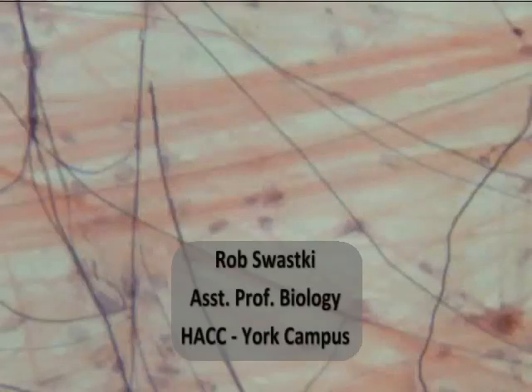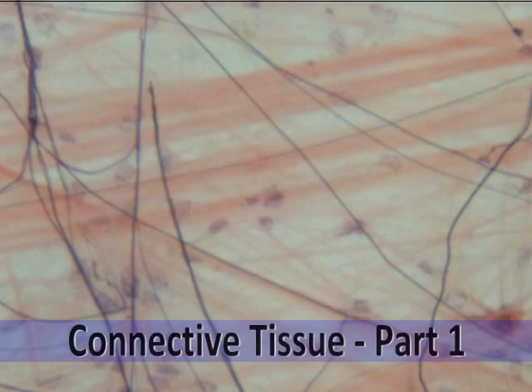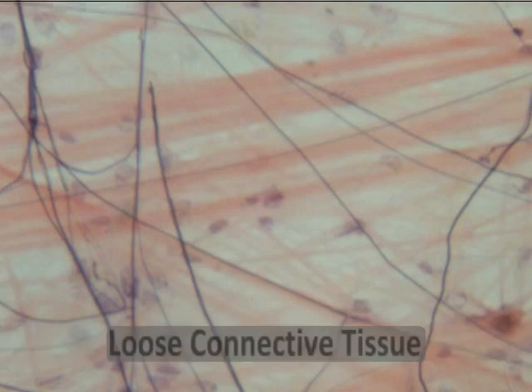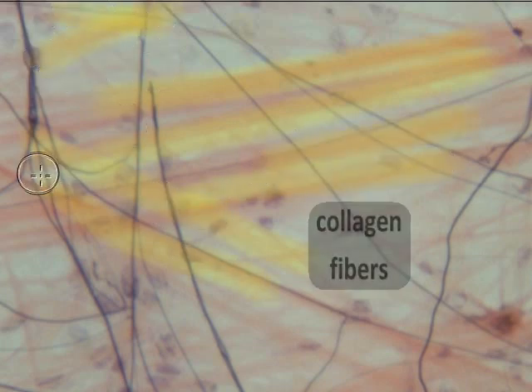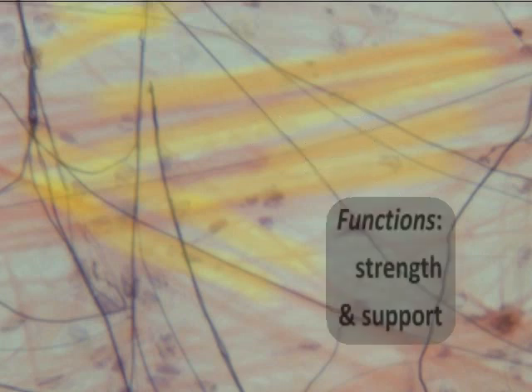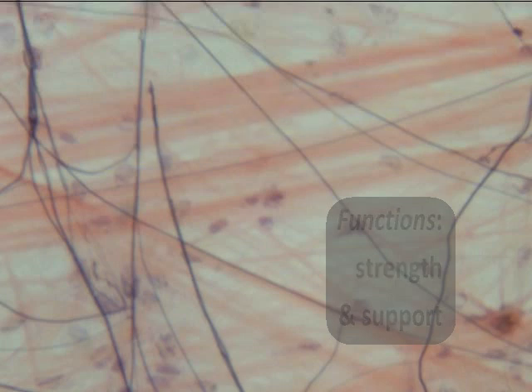Hello everybody, this is Rob Swatsky and this is our histology lab review screencast on connective tissue, primarily the loose connective tissues. Our first one that you're looking at here is areolar connective tissue, and the search image is fabric — it's almost like we're looking at a small piece of clothing underneath the microscope. We have these thick pink-stained collagen proteins crisscrossing and interwoven together to provide tremendous strength and support that areolar connective tissue is known for.